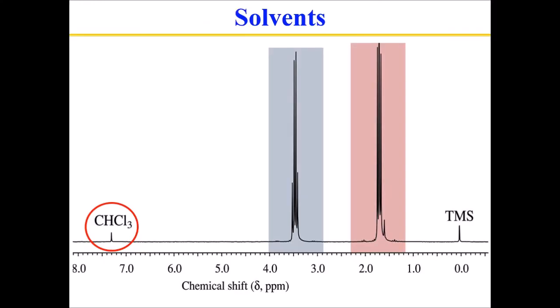When you place chloroethane in an NMR instrument and run the experiment, this is a lot like what your data is going to look like. They actually tend to add a small amount of TMS to the sample as well, and that peak is then scaled to 0. In the computer that you run the experiment on, with some of the programs I've worked with, you can just grab this lower scale right here with your mouse and slide it until that TMS peak is sitting right at 0.